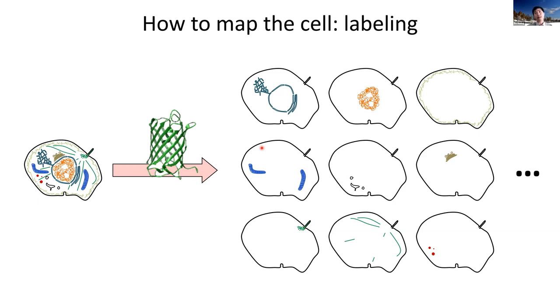Now with the yeast library, it has turned fluorescence microscopy into a discovery tool, where we can just pick a process of interest and unbiasedly analyze the library to identify the players, very much in the same way as genetic screening, CRISPR screening, or proteomics screening can provide us.